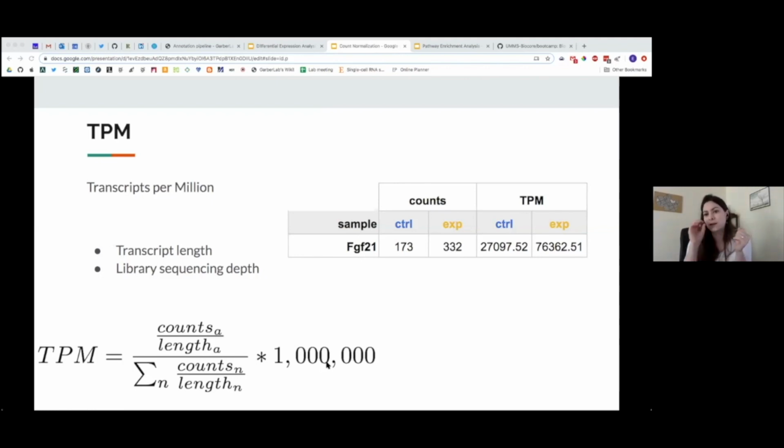We act like the number of reads we saw corresponds to the number of individual transcript molecules, especially if you're working in the case of barcoded transcripts. If you have a unique molecular identifier, then you can really be confident that one read came from one transcript molecule. But in this sense, we're just treating all the counts like they came from individual transcripts. So it is how many counts you assign to that gene, how many counts mapped to the locus of that gene in the genome, and you counted it as seeing that transcript one time in your sample. Does that make sense? I see.